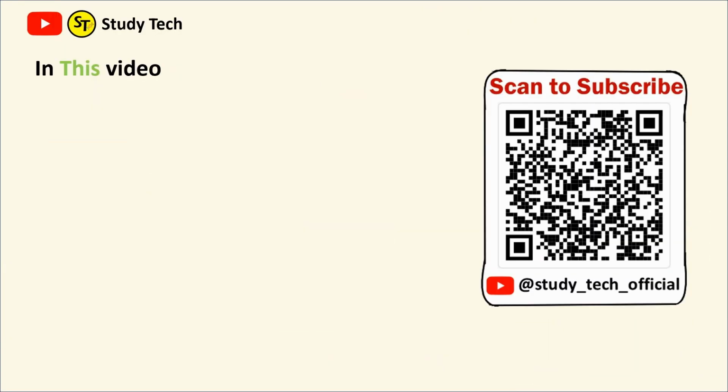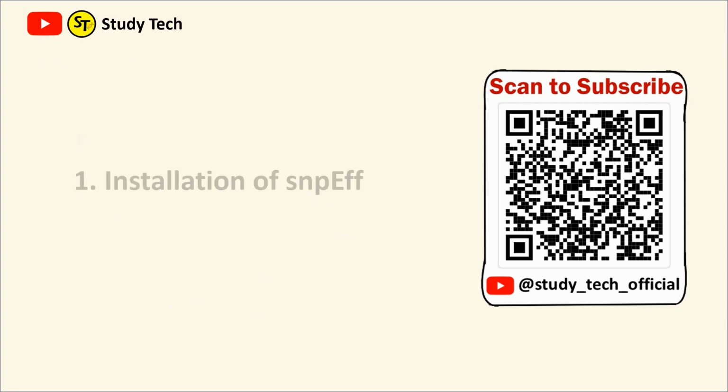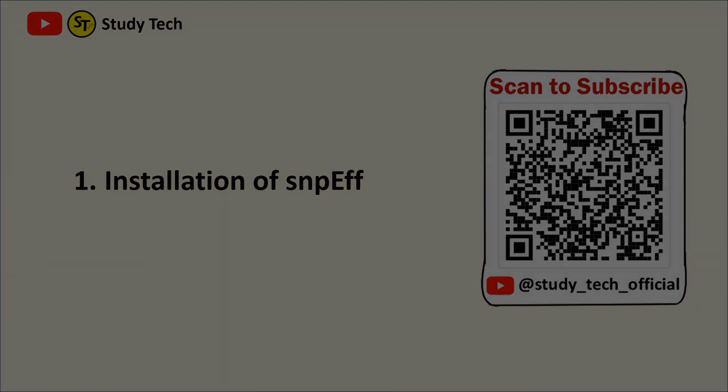So in this video, first I will demonstrate how to install the snpEff tool, and second, how to download the annotated database of Saccharomyces cerevisiae and how to annotate the VCF file and make the result. So let's start with the installation of the snpEff tool.